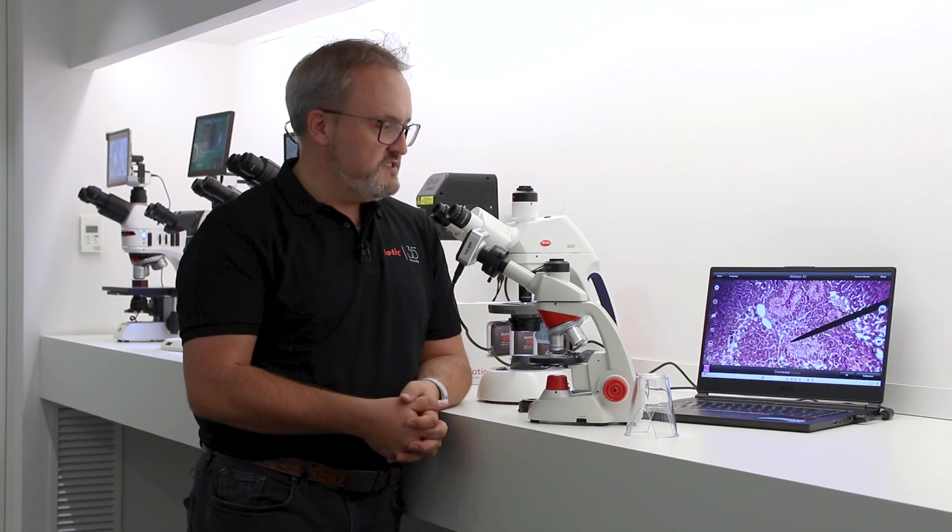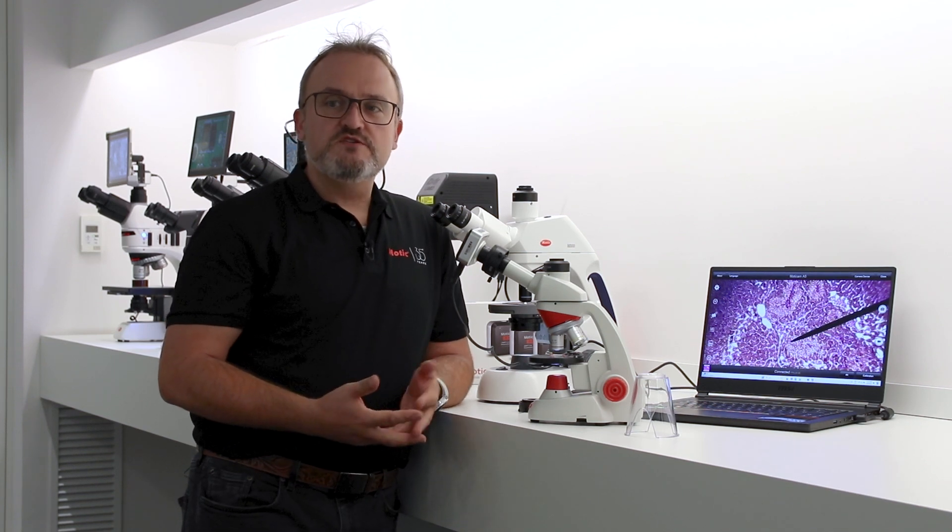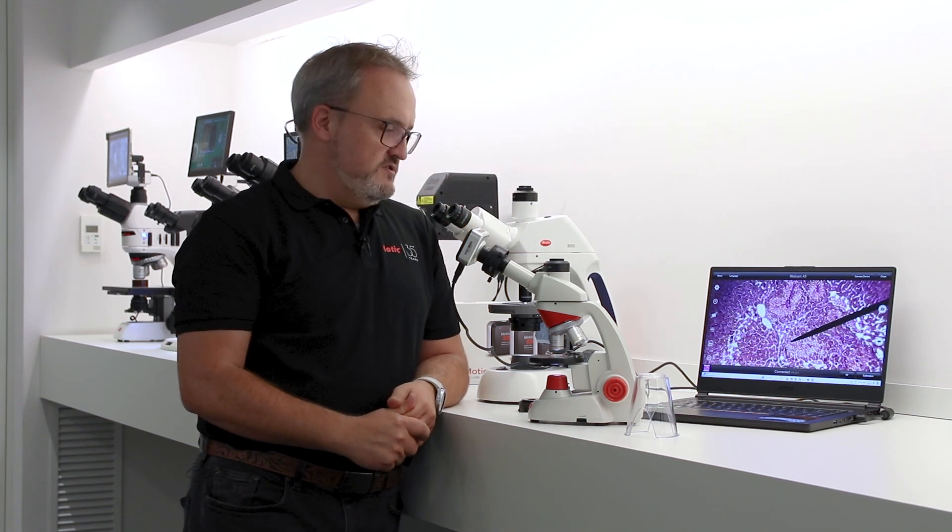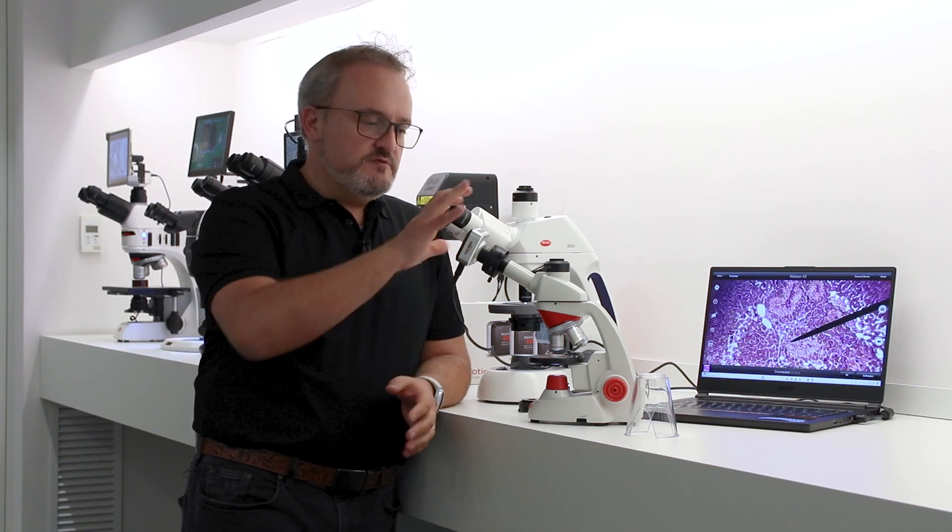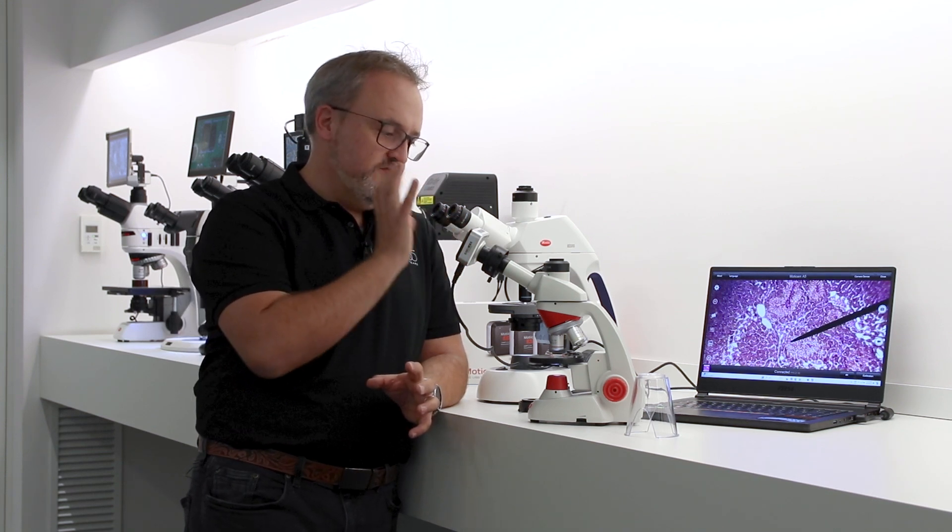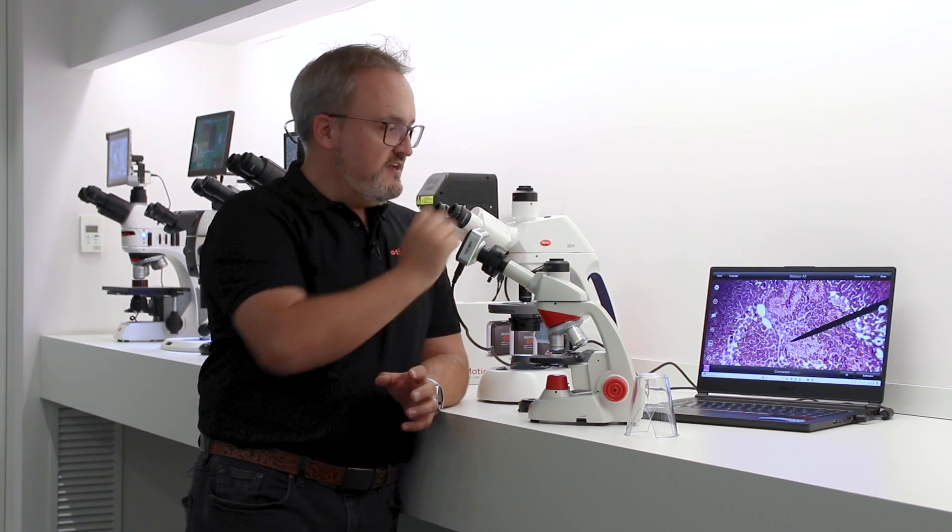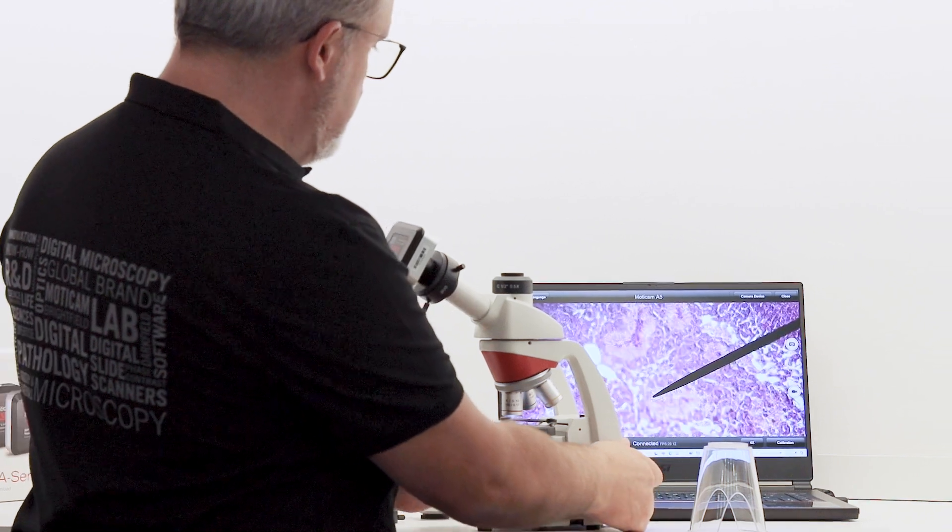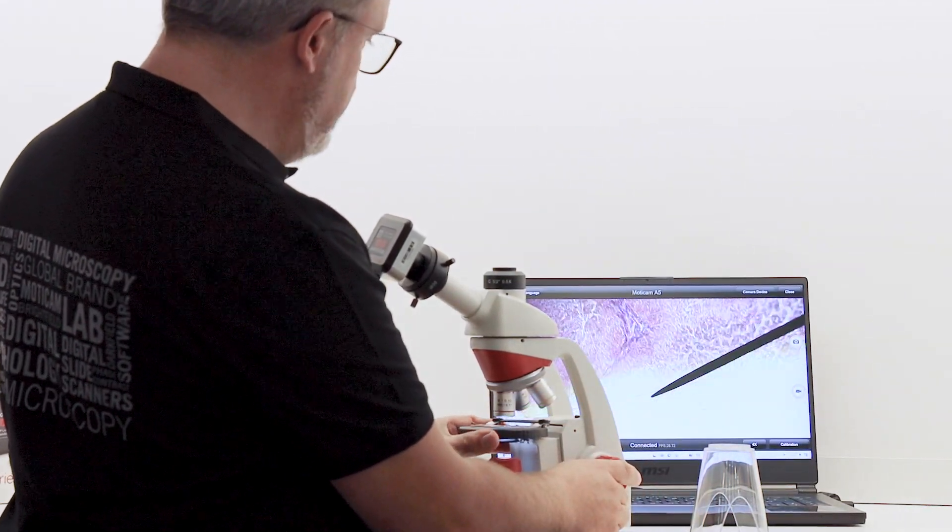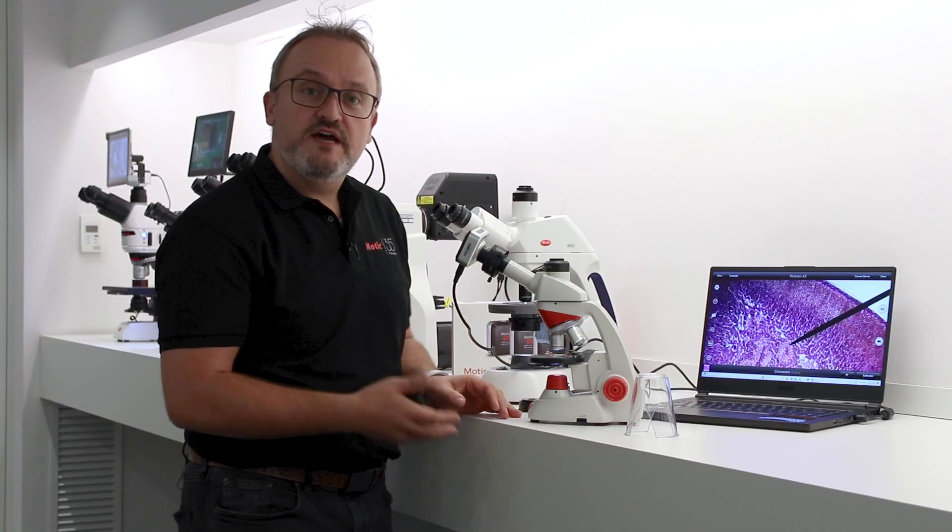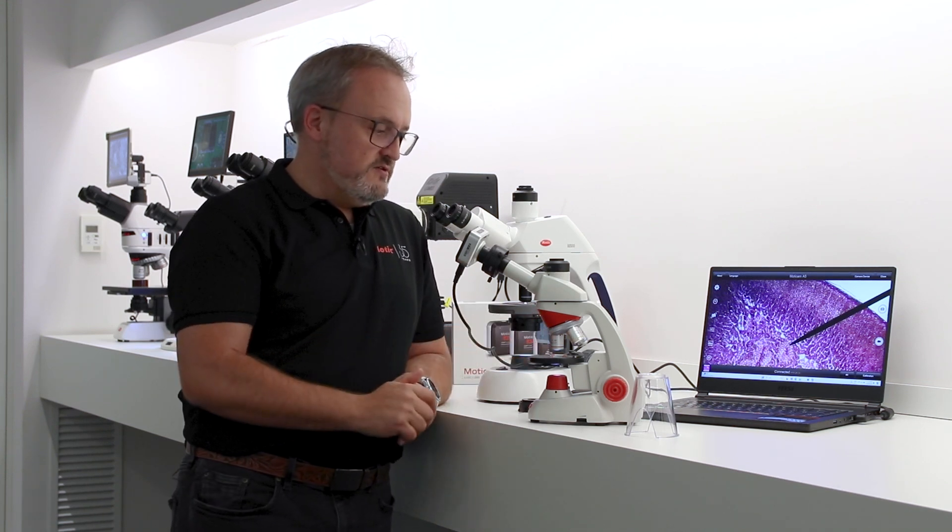Now I have turned a monocular microscope into a digital microscope with the items that already come in the MOTICAM A-Line all-in-one box concept. That means that by considering the A-Line, you don't need to buy new microscopes, you don't need to worry about finding adapters for trinocular microscopes, you don't need to worry about having the budget to upgrade to digital microscopes which have these cameras already built in. You can just buy the camera with all the tools that are inside: hardware camera, software, adapters, so that you can turn them into digital microscopes. Here's the same image as before, just now in a different microscope. I can use this very nice floating stage and now I can use the monocular microscope just like a digital microscope.